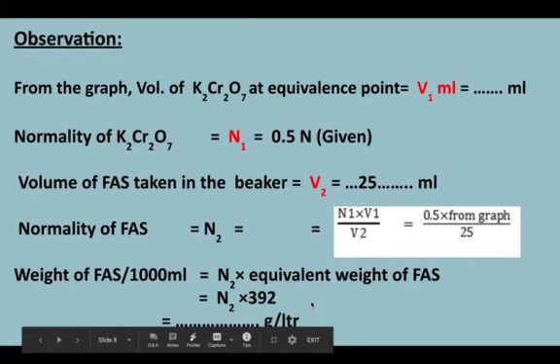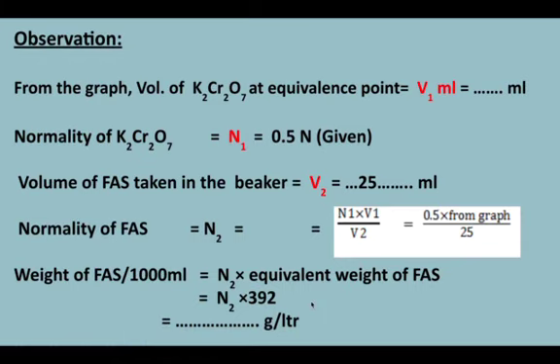So this will be the weight of FAS that is present per liter of the solution that has been provided to you. So this is how we determine the amount of substance present in a solution potentiometrically.